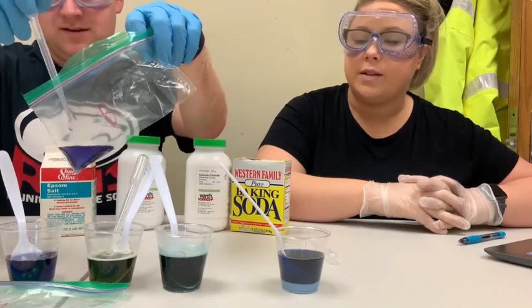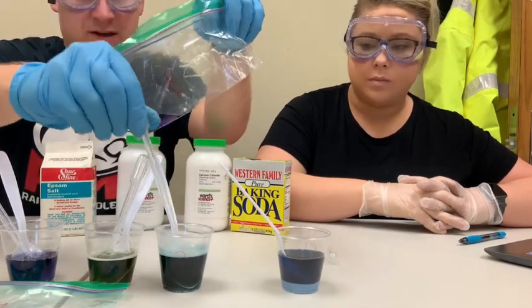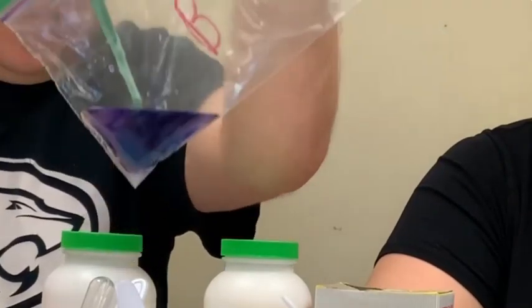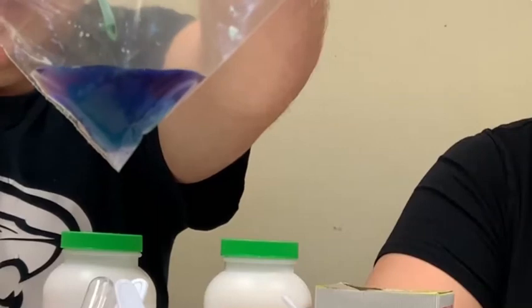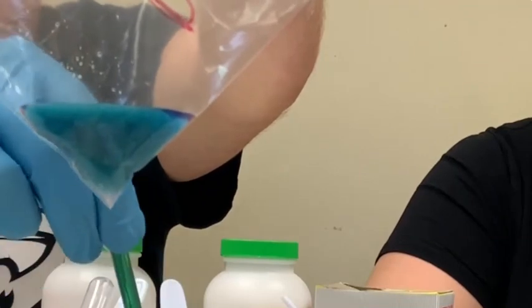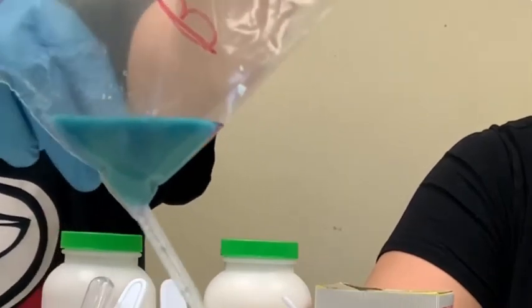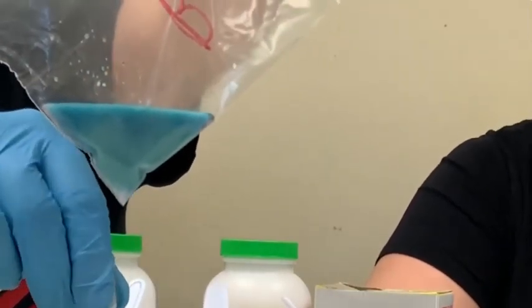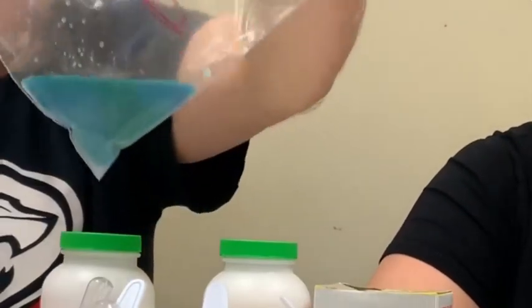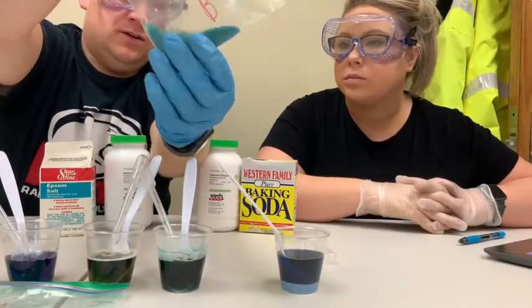There's our magnesium sulfate. You can really see some of the color here. So calcium chloride is this one over here. And we're going to take a look, see what kind of reactions we have. We have a good color change in there. How would you describe that color change there? I would say that this one is like turning more of a light greenish color. So that was 3 as well. Oh, it looks like there might be some white solid grains in there as well.